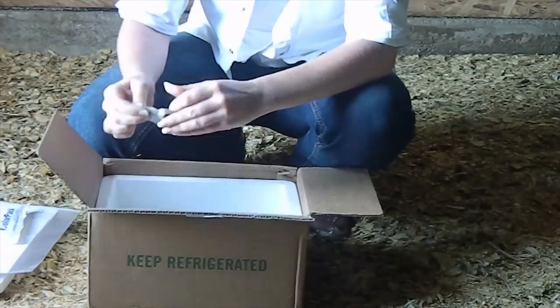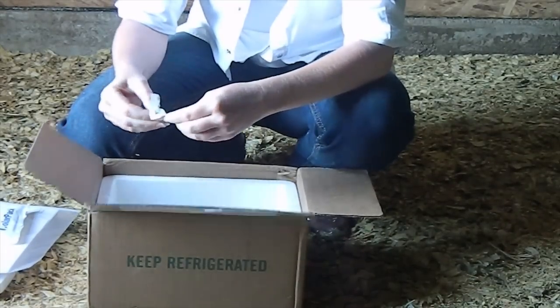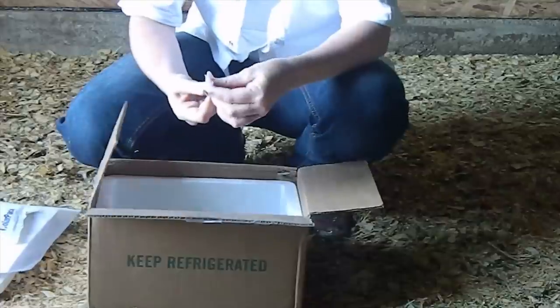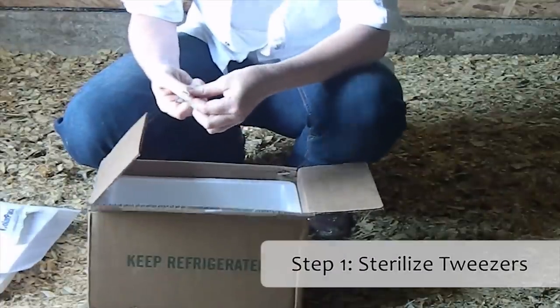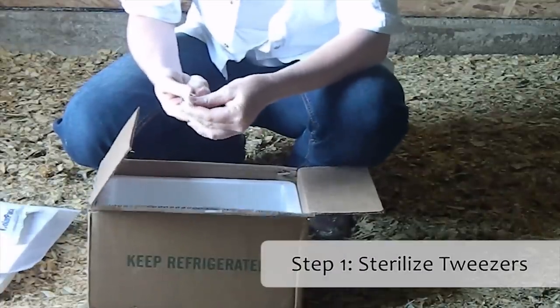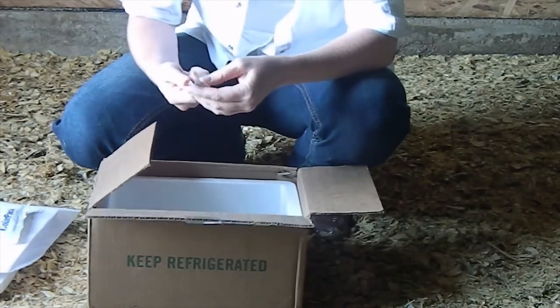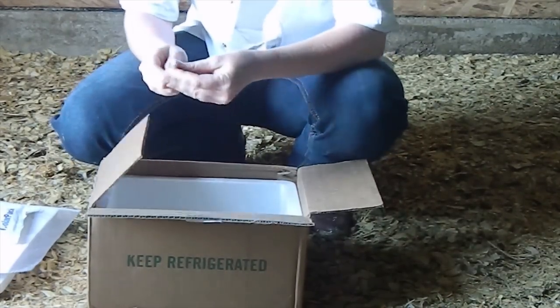So we'll just start with that now. Be sure that you sterilize the tweezers inside and out. Keep those air dry.